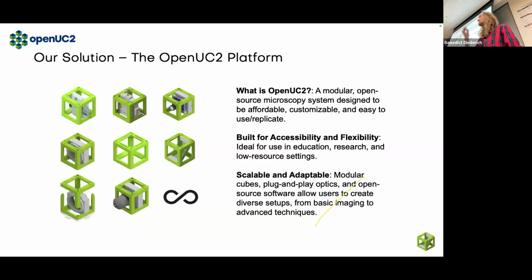So with these cubes, we created a library, like you would have for Arduino sensors, where you have I2C sensors or all kinds of actuators that can be plugged together and operated together. And it's the same for the cube. We have an online library of printable parts, or you can also buy them. And then you have a laser, camera, whatsoever to build something.